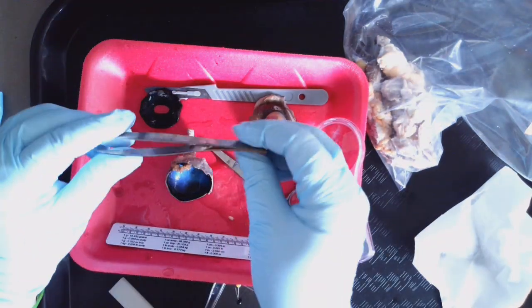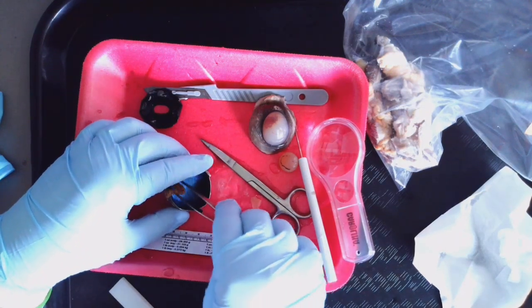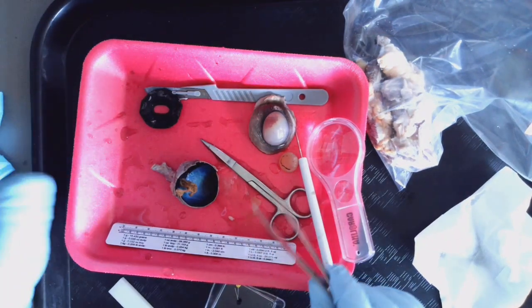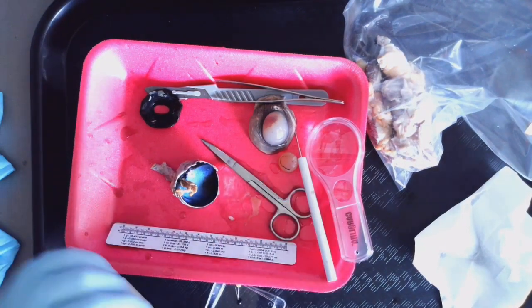I did not use it, but tweezers can help if you are trying to pull up the retina. Again, I did not need them, but the tweezers were available should I have needed them.